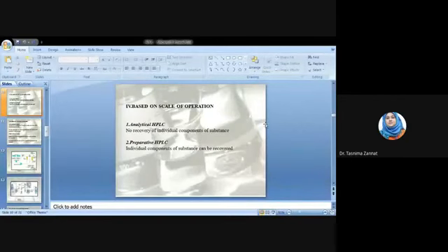Our current discussing topic is HPLC. In my previous class, I already discussed the definition and the principle of HPLC and the classification of HPLC. Today, I want to discuss another classification, because the application of HPLC is too much. It has a vast area, so we can classify HPLC in various ways.